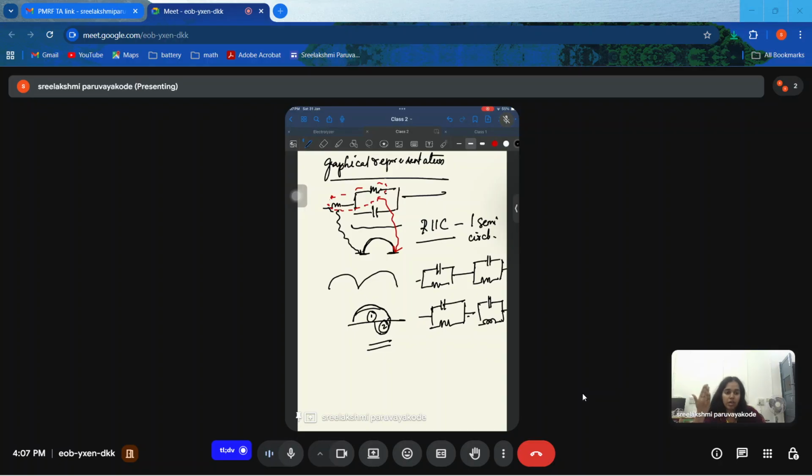But the idea here is that when you have a loop going beneath, in negative imaginary z value, then we can say it is already negative. Do not forget it is minus z imaginary versus z real. And if this value becomes negative, I mean, if it is going to this quadrant, we say it is an inductive loop which can be used.